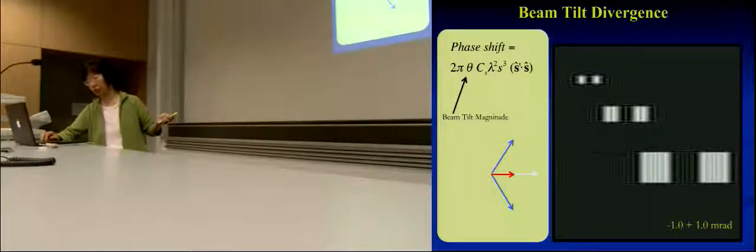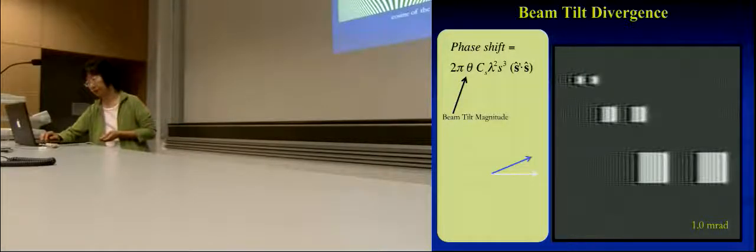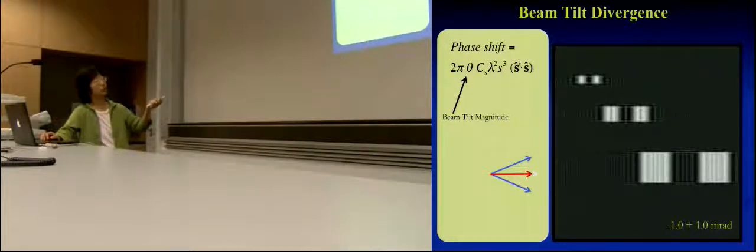So if you look at the images that I created here, I'm trying to show you that effect. With plus direction, we see the common effect that we talked about before. You go to minus, it's going in the other way. You add the two together, the center of your peak becomes the same as the original. You get some kind of an effect on both sides, but the position doesn't change.